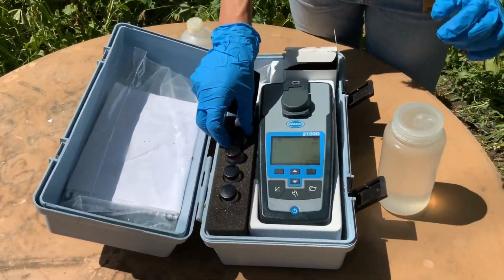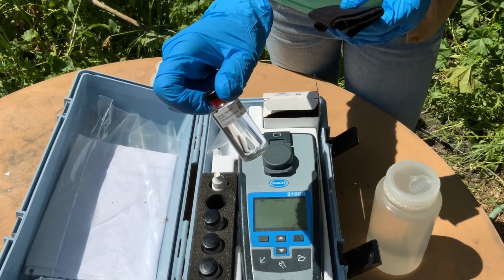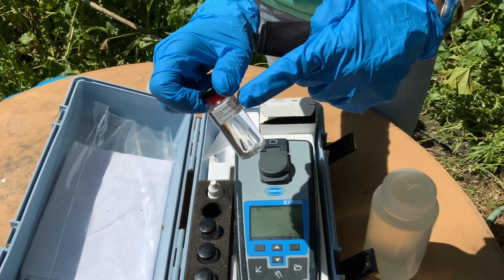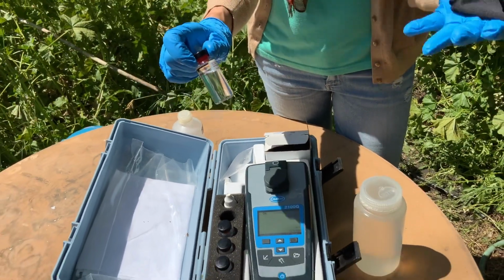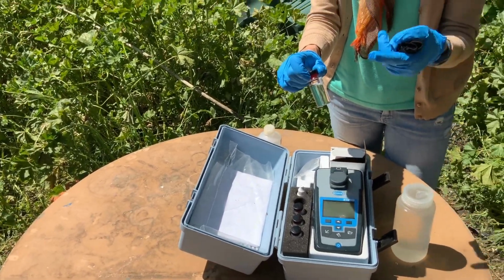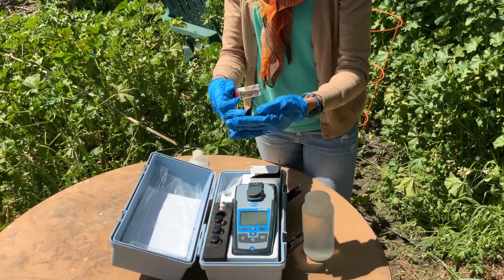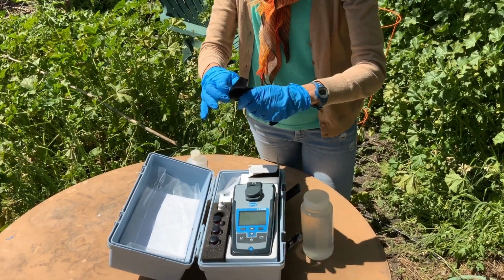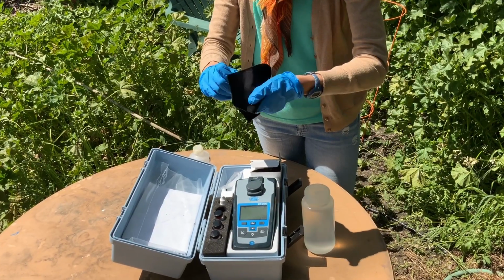And first we're going to take a 10 NTU standard. I don't know if you can see the 10 NTU. And the reason I'm wearing gloves is not to protect my hands from the creek water. It's not gonna hurt my hands. But the reason I'm wearing gloves is to protect the vial. I don't even like to really touch it too much with my hands. I like to try and keep it clean and just touch the cap.